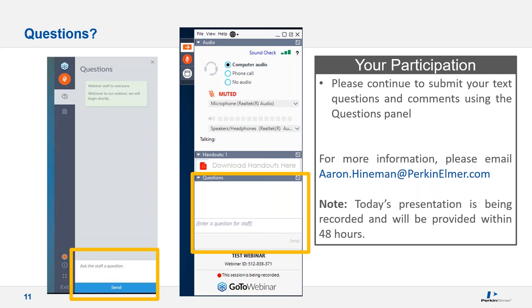Ken, anything? No, that's pretty much it. I'd say the help menu is a pretty good tutorial on it, and in this presentation I tried to outline the steps. It's brief, but that's basically all there is to it. You run your single element interference, single element matrix, and your single element or your blank. You then go into the examine window, and there's the drop-down menu on the far left corner. You select MSF, and then you make your assignments. Once you save the model, then you go file, save the model. Then when you go into the method, I believe it's the processing page, you select how you want to process: MSF, IEC, or none, and then you select which analyte you apply it to. It's difficult to describe the details without looking at the software, but there is information in the help file that describes all this.